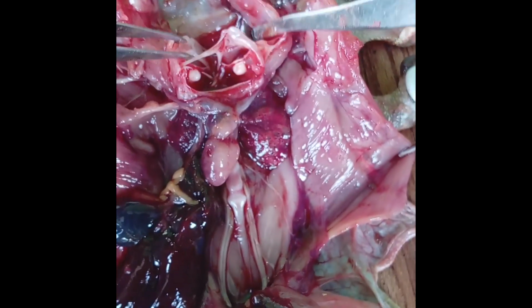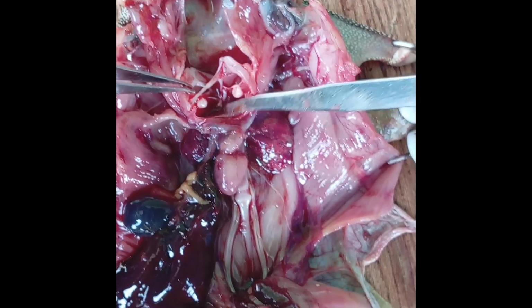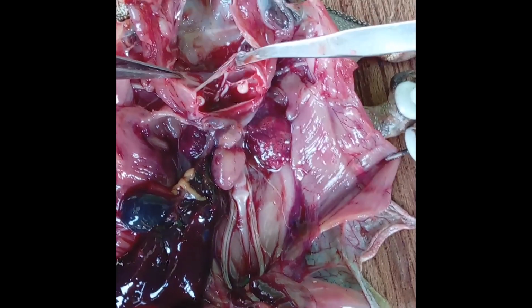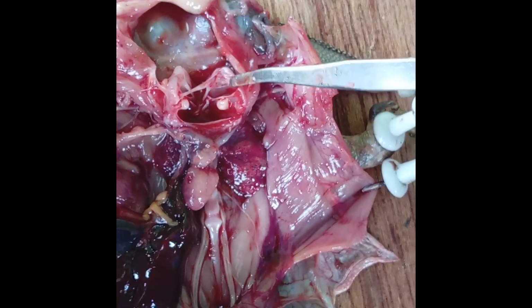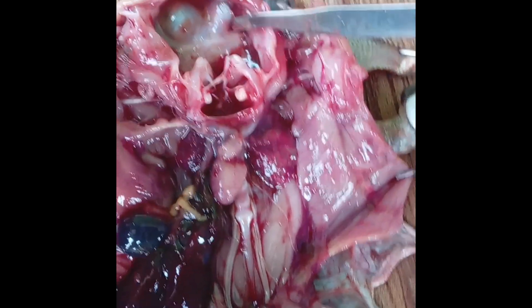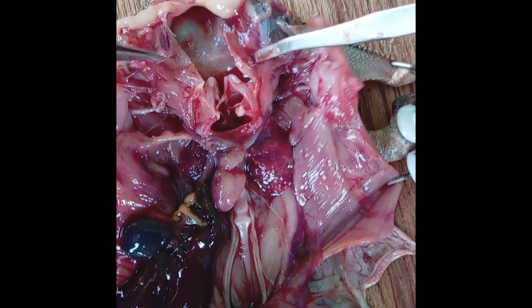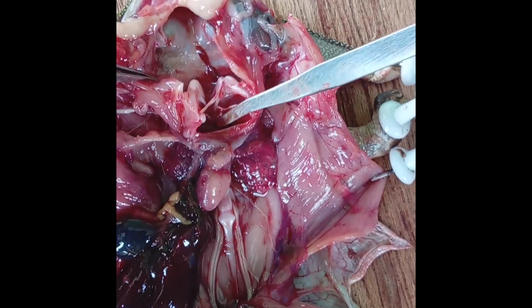The structures are still being seen here, and we want to show that the chamber is connected to the buccal cavity, but is also connected to the lungs. Because it's a chamber, the air passage for breathing goes on from the buccal cavity and is then connected to the lungs.